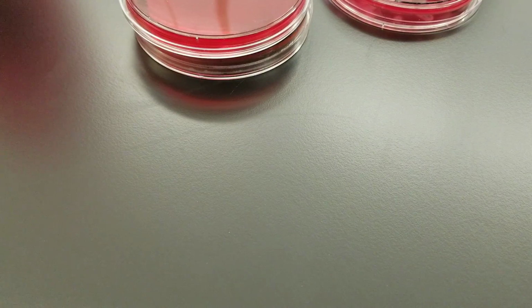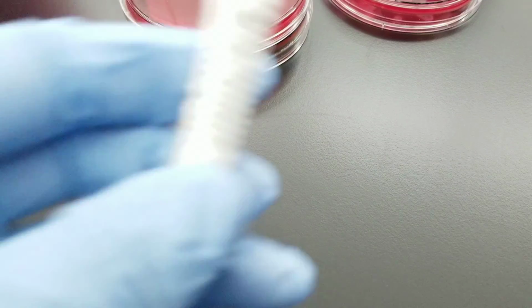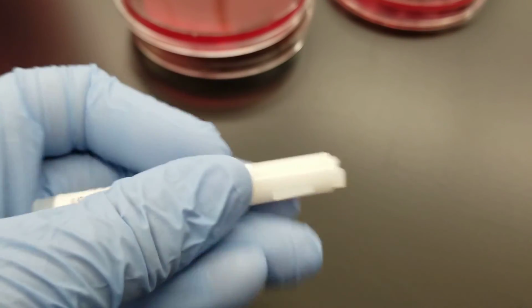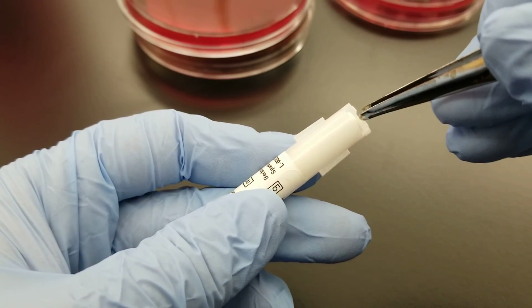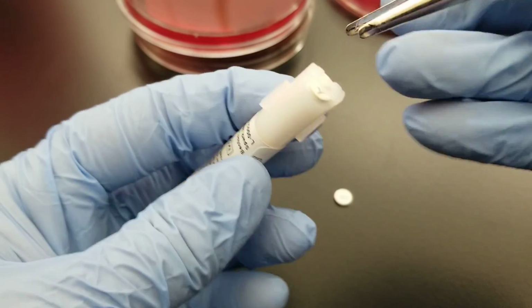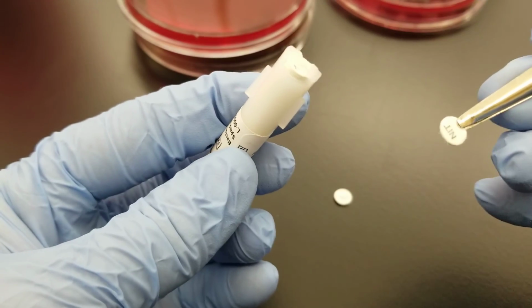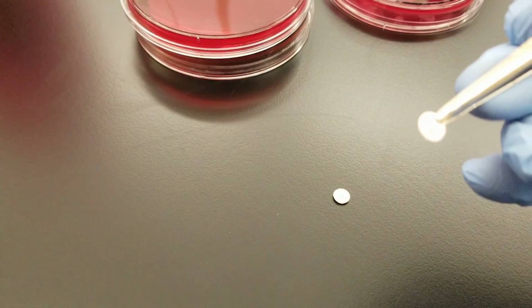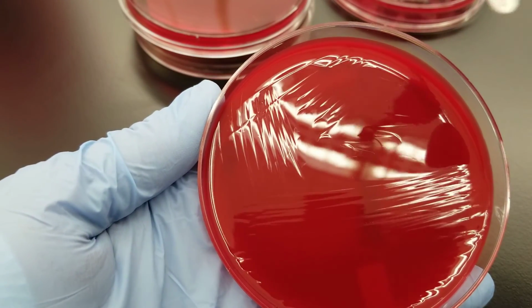All right, so now we're going to place the discs. You're going to get clean forceps or tweezers. I'm using this one first, and I'm going to put the nitrate disc on first. Well, that didn't go so well. Let's try that again. I'm going to pull out one nitrate disc, and I'm going to gently place it on the second quadrant.